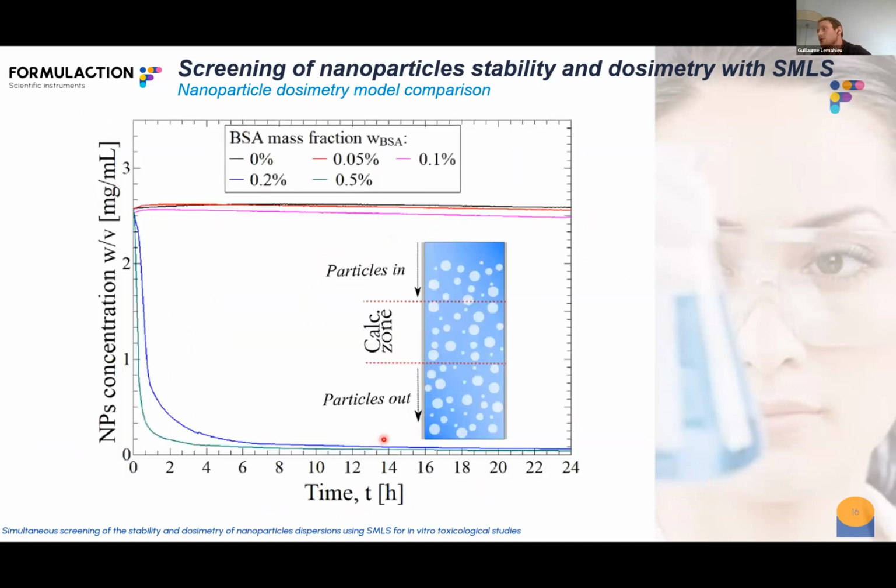And we can have such a graphic, which is really interesting for me, especially for the dosimetry of particles, to see how the concentration will evolve in the sample as a function of time. And that is quite useful to estimate if I will have the same concentrations when I have created the product and when I collect the sample for further analysis.